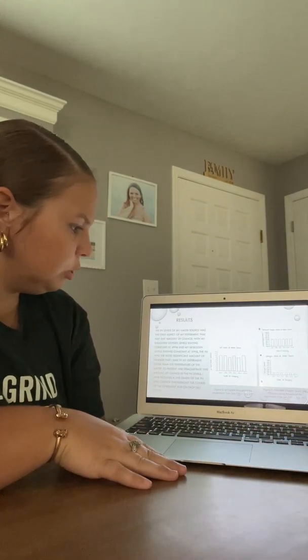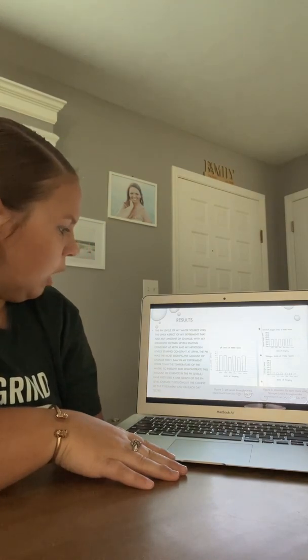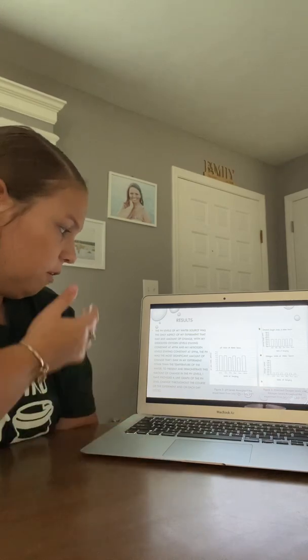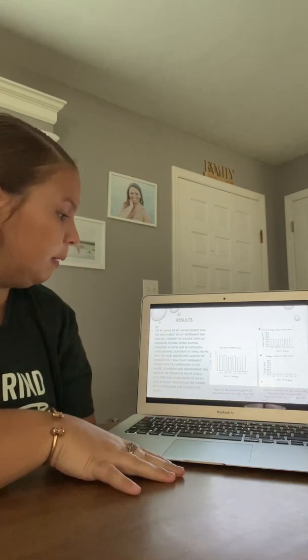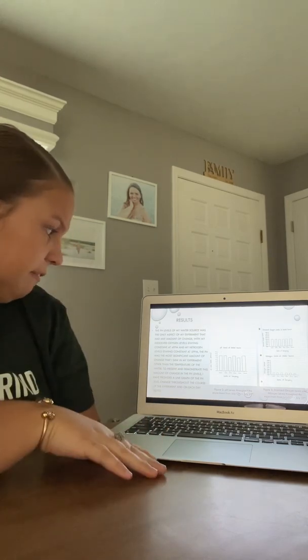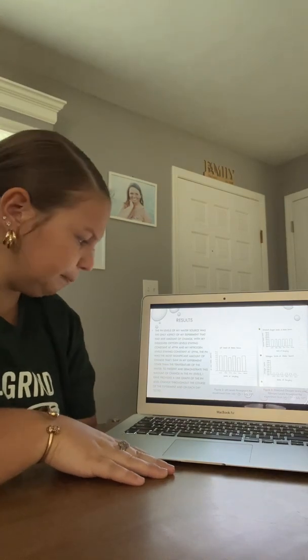So on to my results. The pH levels of my water source was the only aspect of my experiment that had any amount of change, with my dissolved oxygen levels staying constant at 4 ppm and my nitrogen levels staying constant at 5 ppm. The pH was the most significant amount of change that I saw in my experiment, other than the temperature of the water.